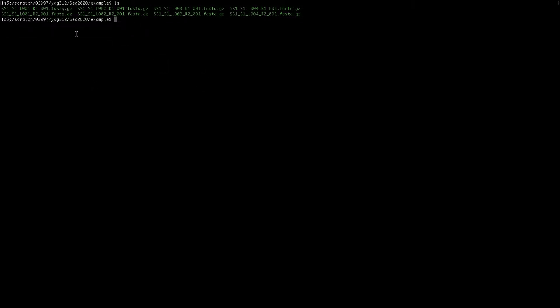In this video I'm going to show you how to combine multiple FASTQ files and how to unzip zipped FASTQ files. A lot of times if you have a large number of reads, your sequencer, for example Illumina HiSeq sequencer, will give you multiple FASTQ files. For example, here SS1 is one sample, but you have four SS1 files (1, 2, 3, 4) for r1, that is read 1, and four r2 files, that's read 2.